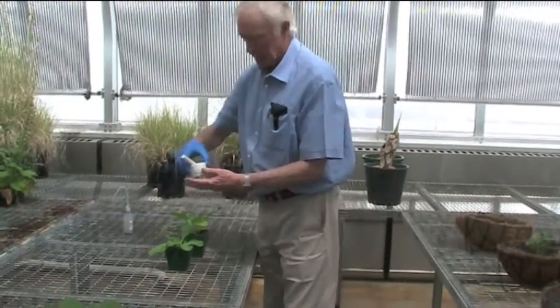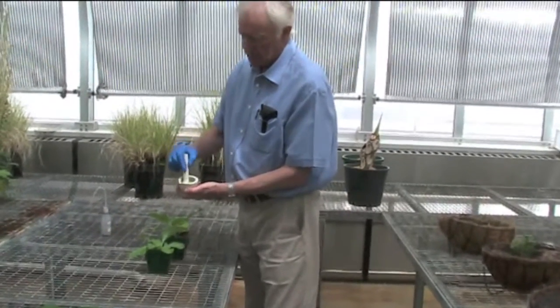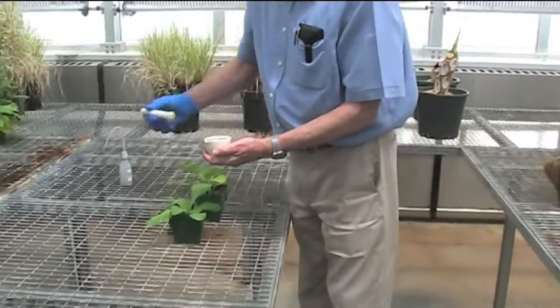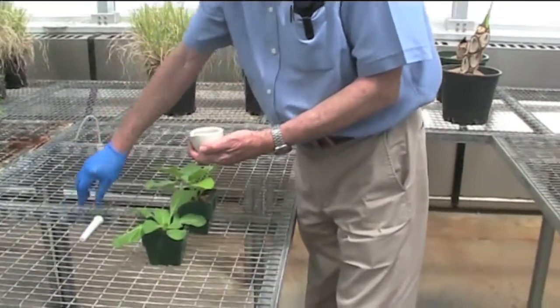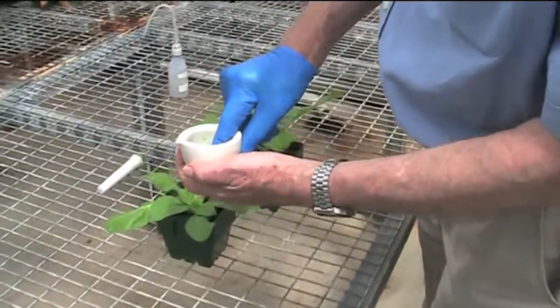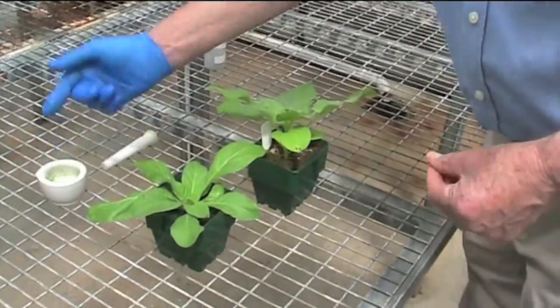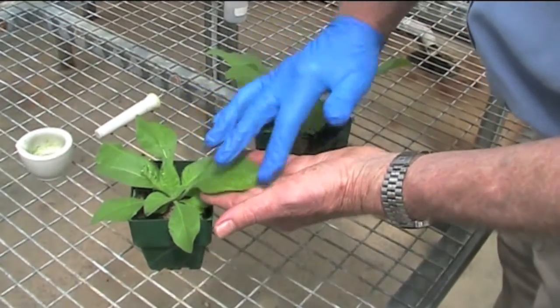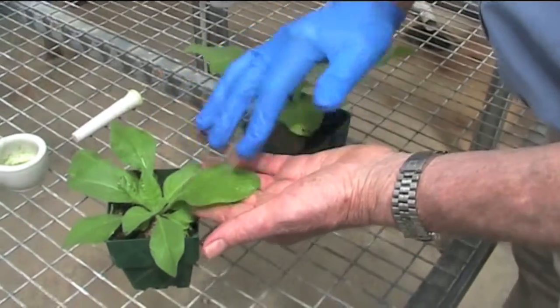For the inoculum — we've just prepared that — we use it as the sap extract. We dip our finger into the inoculum, and that is enough inoculum to apply to leaves. Then we simply wipe the leaves three to four times with the inoculum.